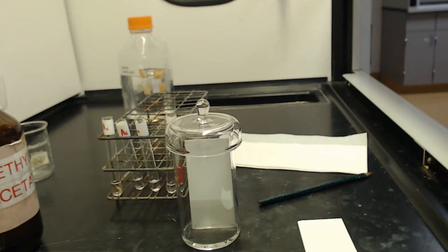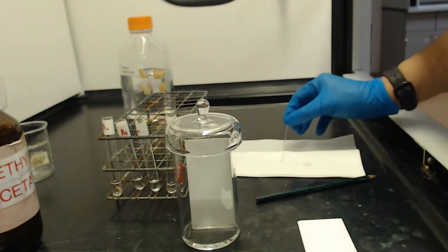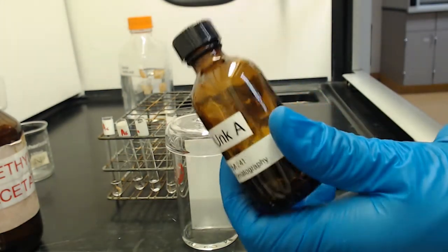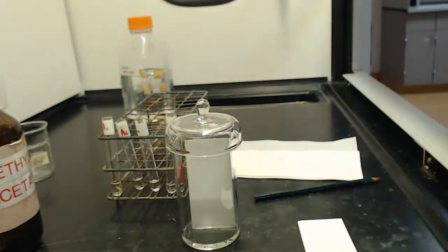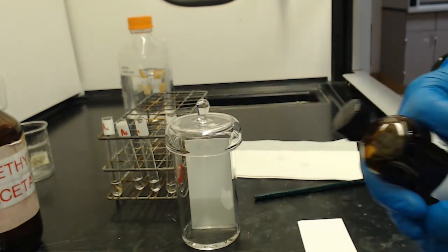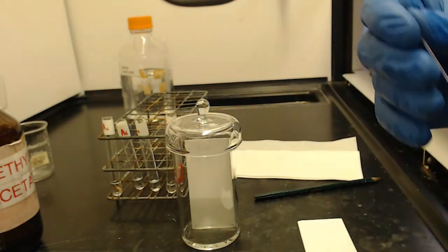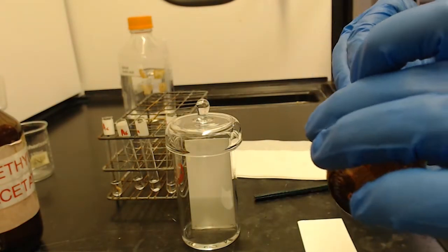Now I'm going to go ahead and get our unknown. I am not sure what is in the unknown, because it is unknown to me as well. I'm assuming it's one of these compounds because it was in the box for this lab. Is it unknown A? I don't know what it is either, so we're going to find out together. Typically, when I make the unknowns, there are 2 compounds, and you have to figure out which 2 it is by their Rf values.